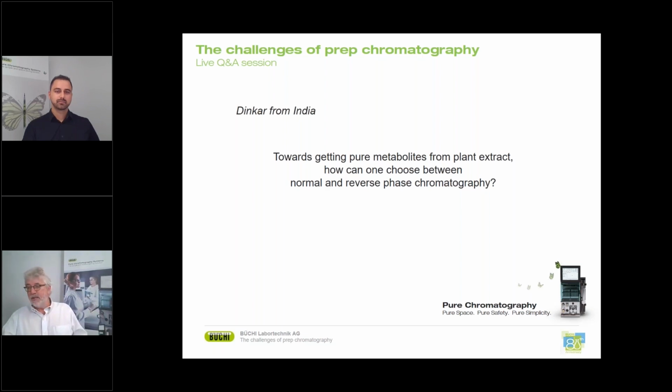Are you using water alcohol or mixtures of both as an extraction solvent, or do you use organic solvents like hexane or similar solvents to do your extraction? Again, if that is, imagine ethanol water is used, well, again, for the reasons I already mentioned before, I think reversed phase will be the choice to do.